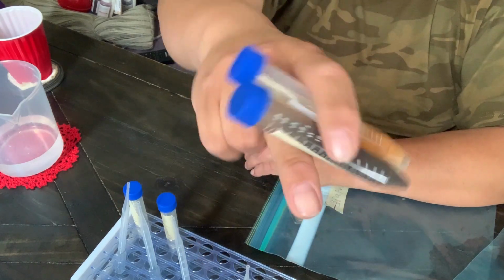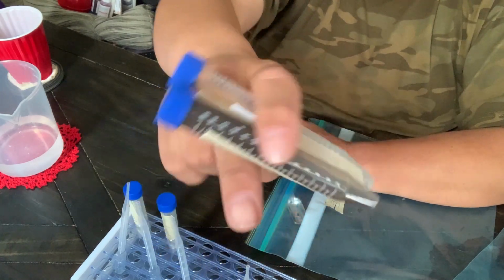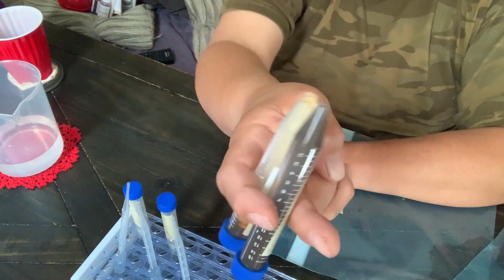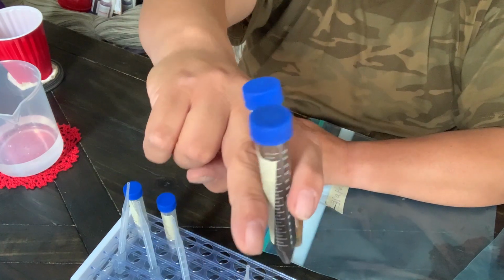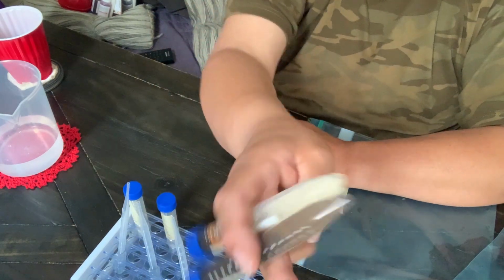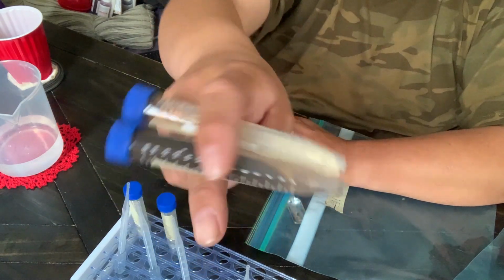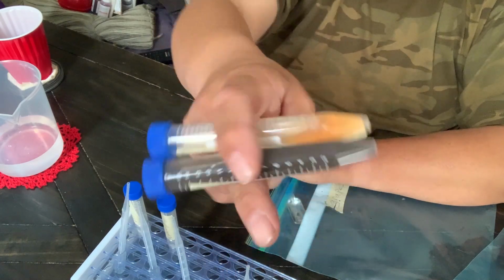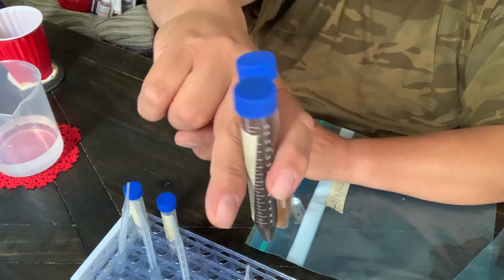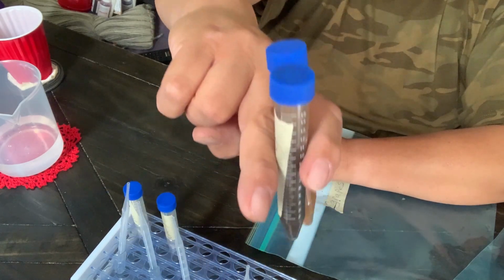And then we're gonna have to do this again when we're ready to put it into our slide to watch it under the microscope, because it probably will settle. So we just do this for 1 minute. You need to see here how gentle a roll it is, so we don't disturb or damage our microorganism specimen. And when we take a sample, we want to take the sample of the liquid, not the material, what they call matter. It's just the liquid, because the liquid will contain the microbes.